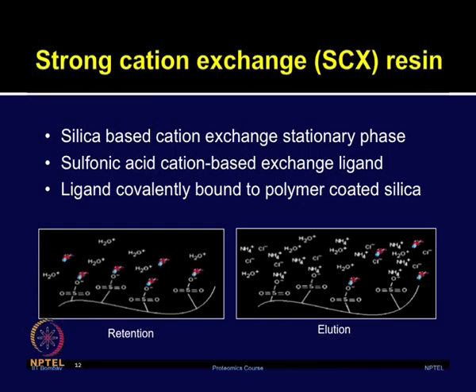One is retention, the other is elution. Retention is based on the electrostatic attraction between the negatively charged sulfonic acid and positively charged peptides. The elution can be performed by an exchange of peptides for the cation of the mobile phase additive, the ammonium ions, in reaction to the high concentration of cations.